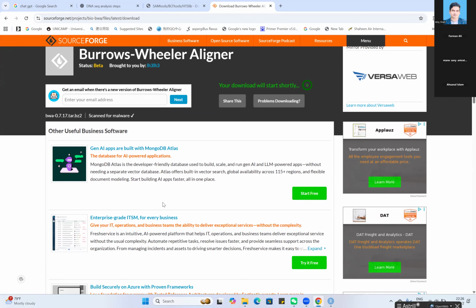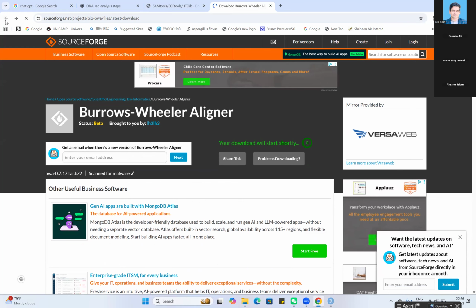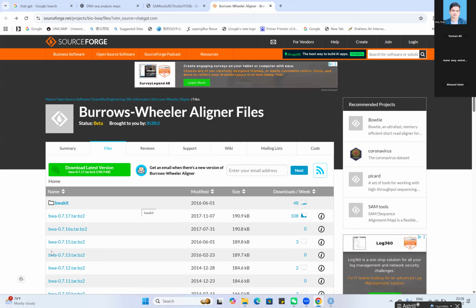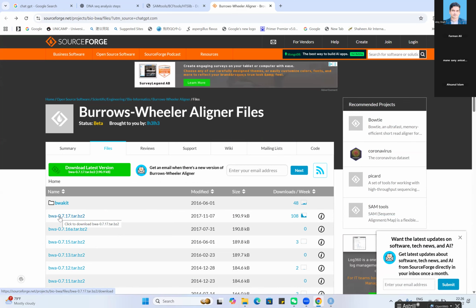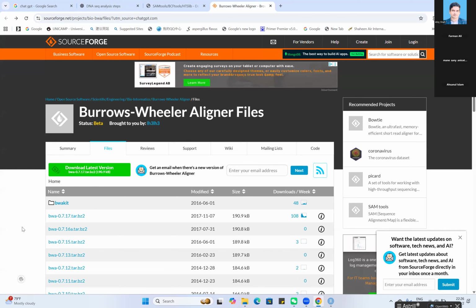Okay, scroll back. Please click on back. Yes. Here is BWA. Please show me in ChatGPT the latest tool name. It is showing you Windows, zip, and BWA. Okay, now again come to the website, scroll down and check the latest version.